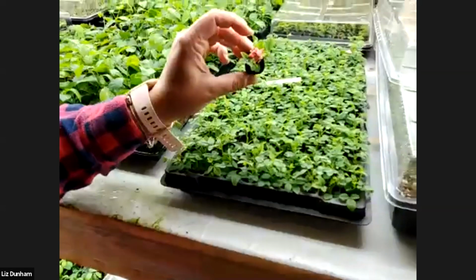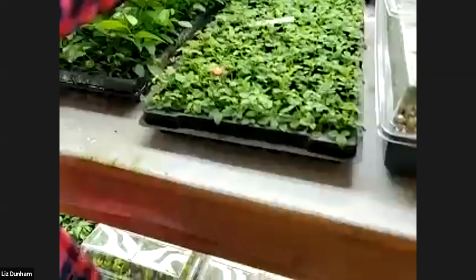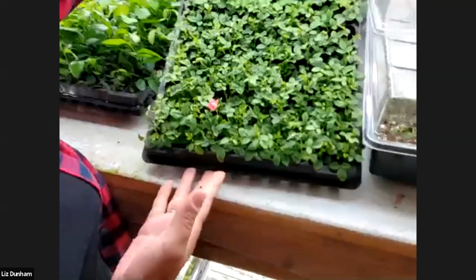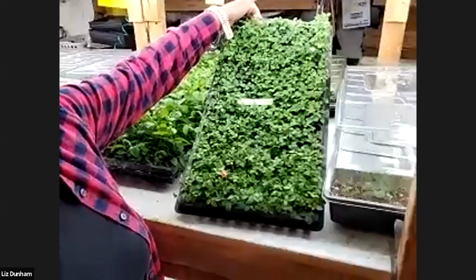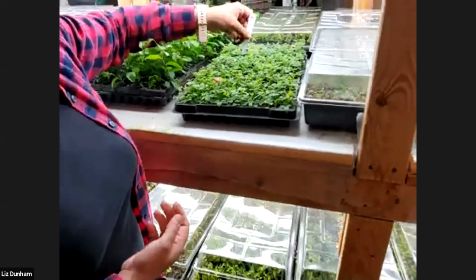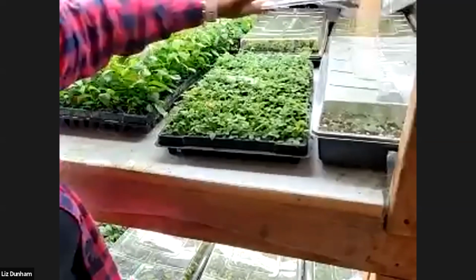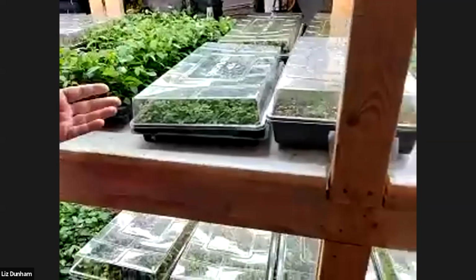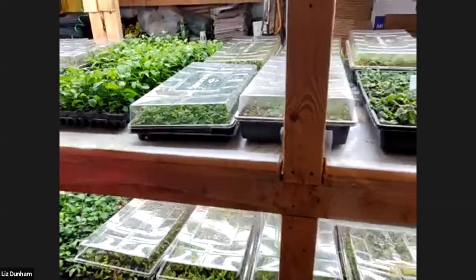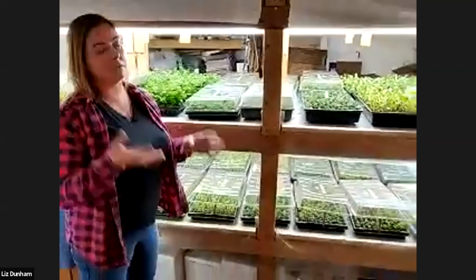Isn't it cute? Sometimes they flower pretty quickly, especially the roses. And you can see the nice uniformity that we get from tissue culture. This is what it's supposed to look like from tissue culture. So these were done 7/7. So that is pretty quick. I'm taking the lid off. You can see that we do domes. It's very low tech, but it works, especially since we do such a wide variety of crop with different timing.